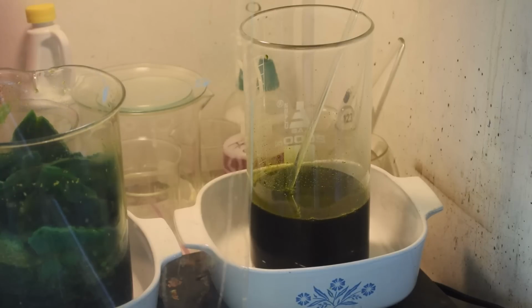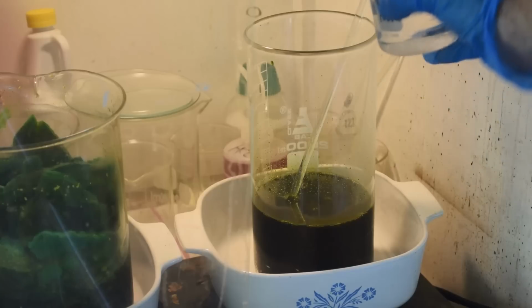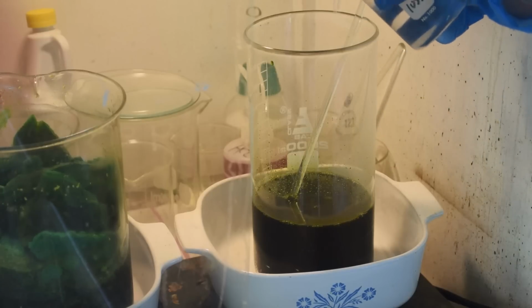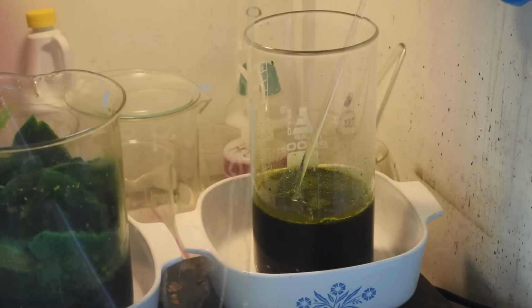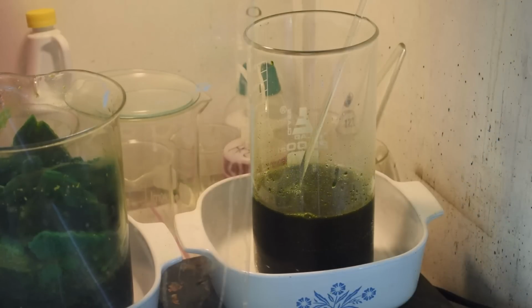I'll tell you what, I'm going to try dissolving some of this in water and make a saturated solution, and we'll see what that does. Well, in the time it's taken me to make up this little bit of saturated solution, I've seen a fair amount of bubbling happen in there, so I'd say we are getting denoxed. Let me see what happens when I put this in. Yeah, there we go. There's the fizzing I'm looking for. I really didn't want to put more water in because I've worked hard to dehydrate this stuff, but you got to do what you got to do, you know, to denox it.